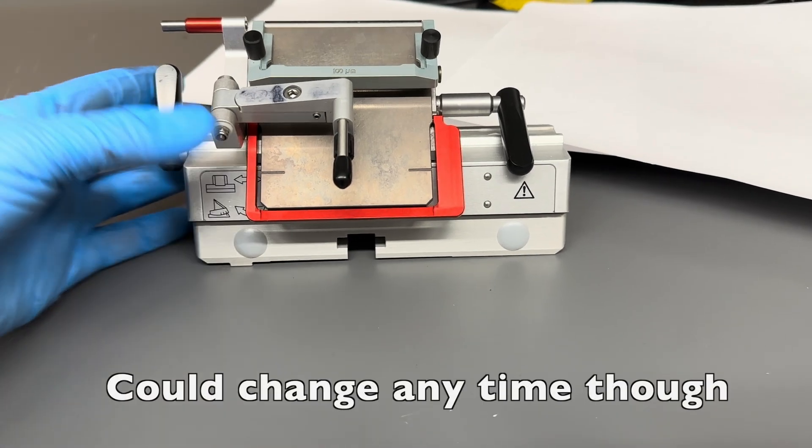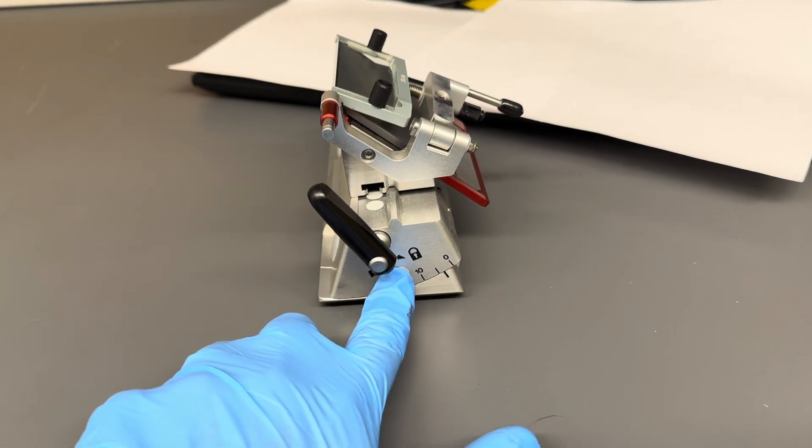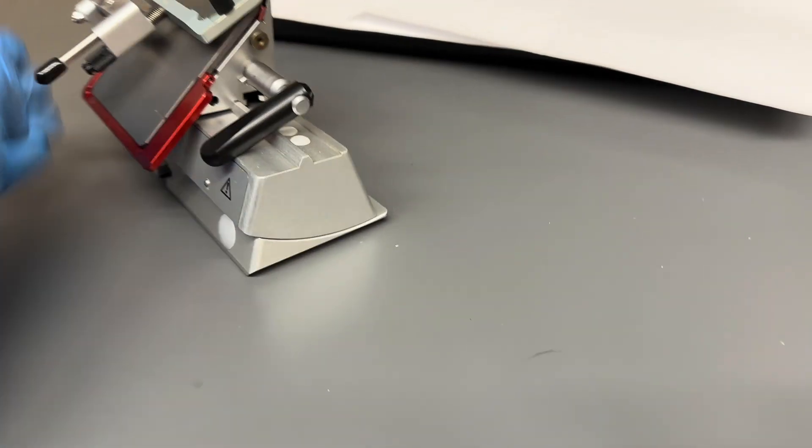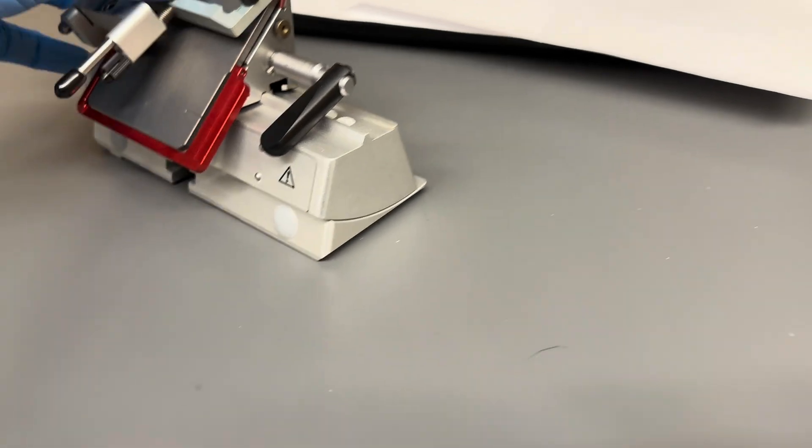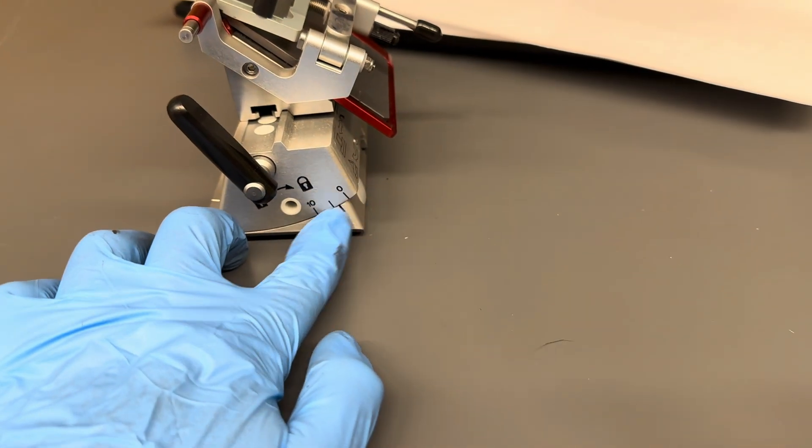What I wanted to show you is that Leica has actually removed the lever. There would have been a lever here, perhaps over here, to adjust the knife angle, which should be somewhere between three and five degrees.